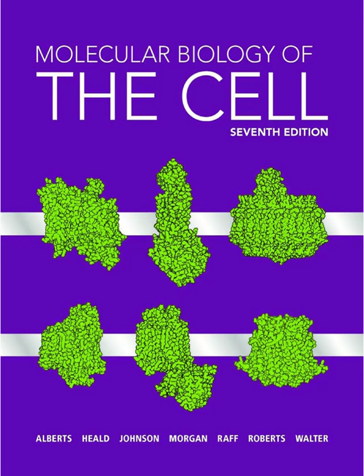Okay, TEM gives amazing internal detail, but what if you want that 3D surface view, like the outside of a cell or even an insect? For that, you use scanning electron microscopy, SEM. SEM. How is it different from TEM? Instead of transmitting electrons through a thin section, SEM scans a focused beam of electrons across the surface of a bulk 3D specimen. And detects... It detects electrons that are scattered off the surface, backscattered electrons, or electrons that are knocked out of the specimen's atoms by the beam, secondary electrons.